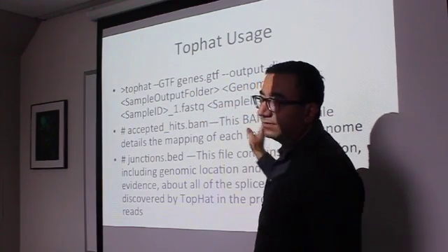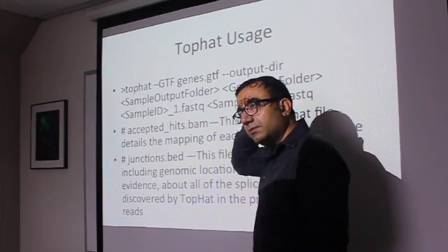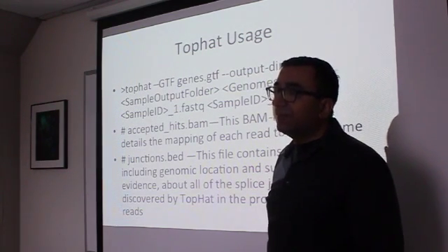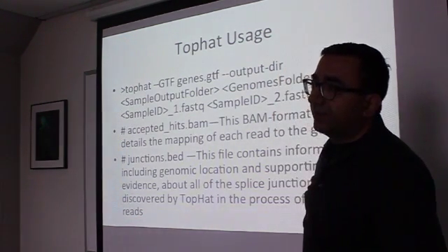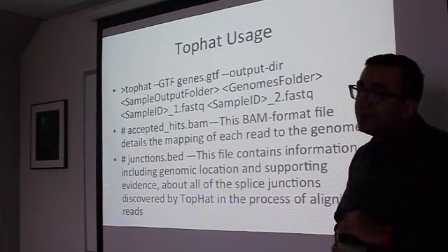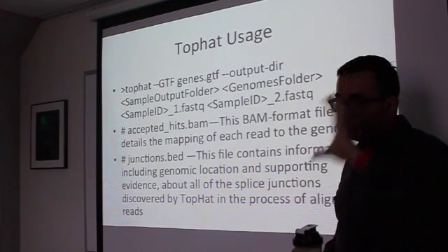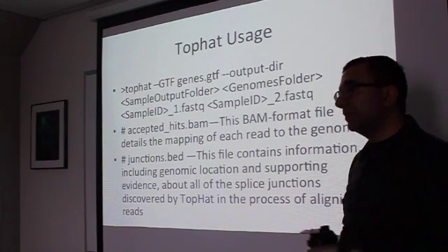Let's say you're running 3 biological replicates in the same lane. If you want to treat them as one sample, you can do that as well. If you separate by comma, then it'll treat it as one sample. But if you want to align everything separately, you want a separate output file. The question is, do you want all the reads in one file? Because I've done that. I've taken all the replicates and put them in one, and it just outputs everything into one file. Okay, gotcha.